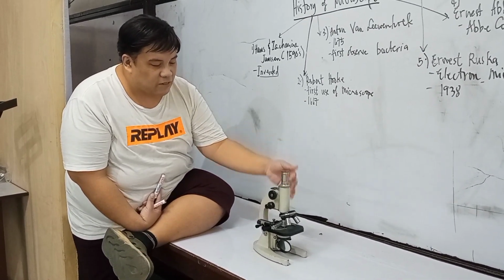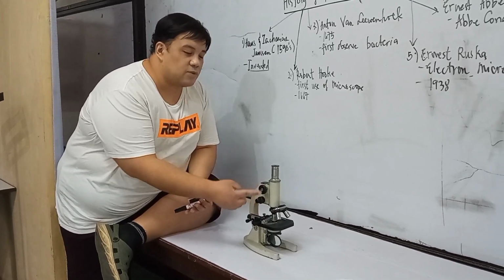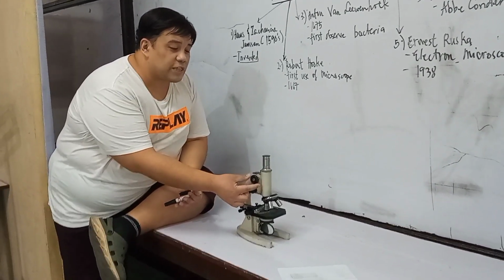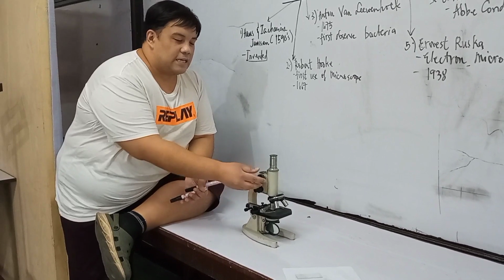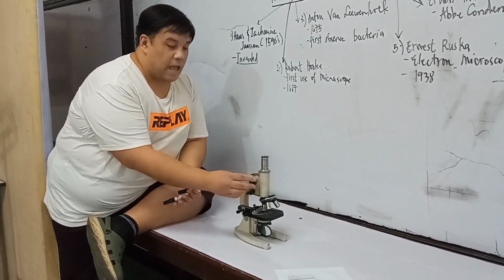Ngayon, pagdating dito, you have there two knobs. We have here the coarse adjustment knob.